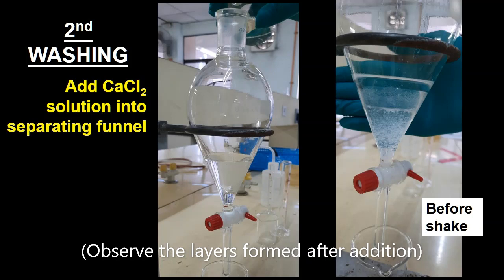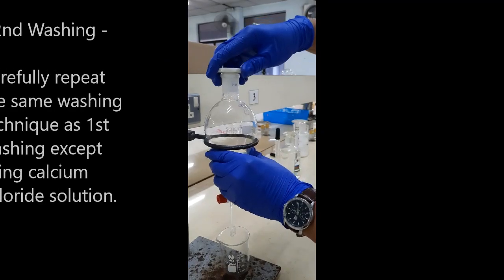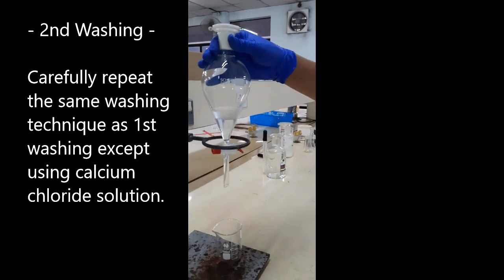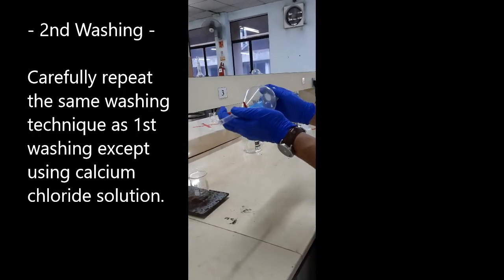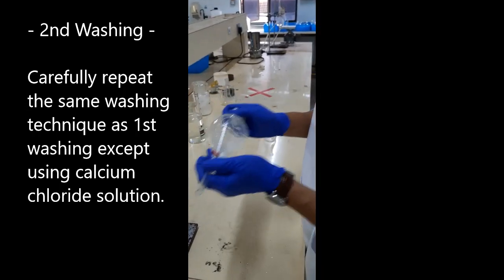Then wash the organic layer with calcium chloride solution. Repeat the same steps in the first washing.